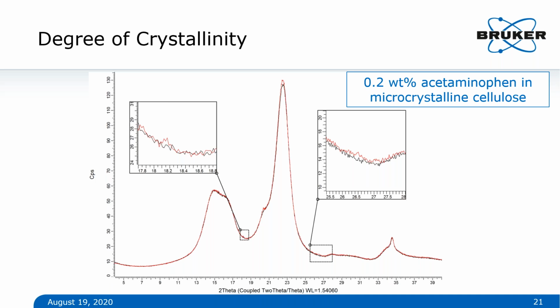Unfortunately, in a case like this, because, like the previous question mentioned, I have quite some significant contribution from excipients, and this is the true sample. There are a large amount of excipients here. Determining what your true background is, is a little bit tricky.